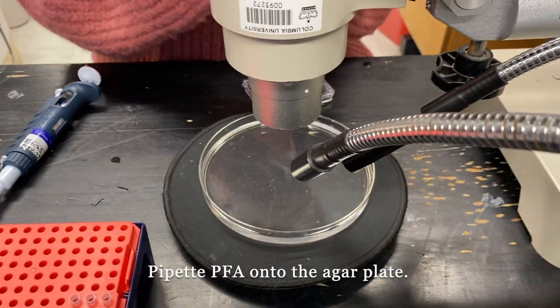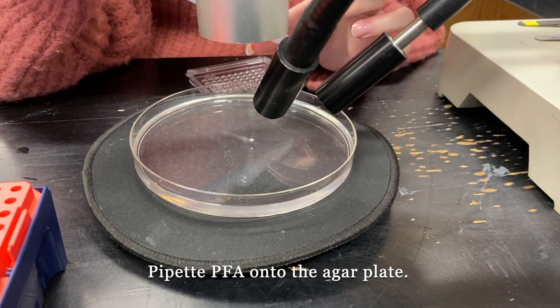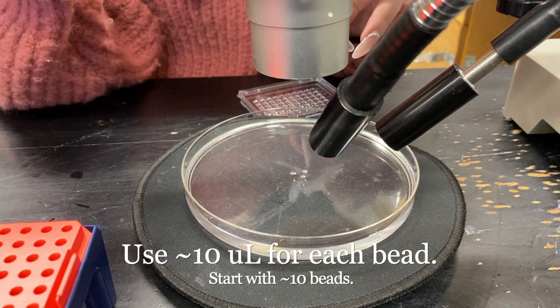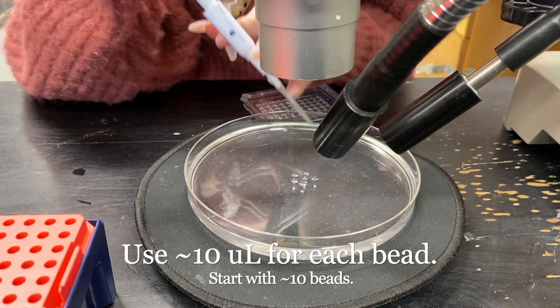As we knock the flies out, we can pipette PFA, the fixation solution, onto the agar plate. Pipette about 10 beads of PFA onto the plate.